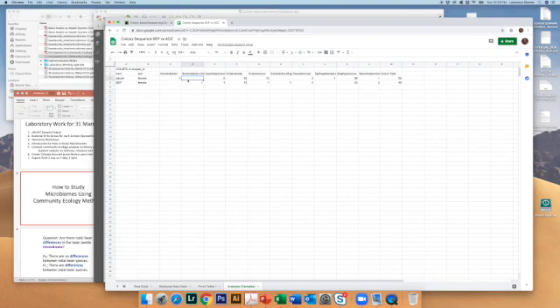Okay, one more thing you want to do. The empty cells had no counts in them, so those should be zeros. Just enter zeros in those empty cells. So there are 2 there and there are 2 here. There we go. Now we're ready to do something interesting.